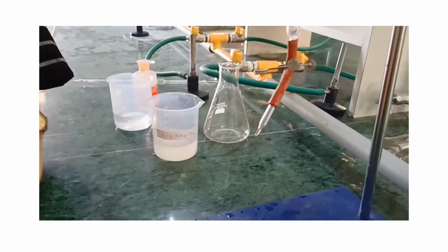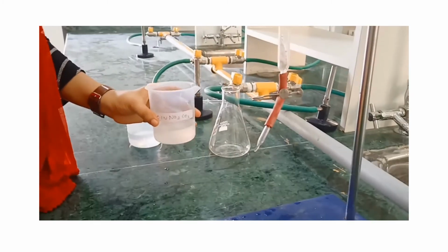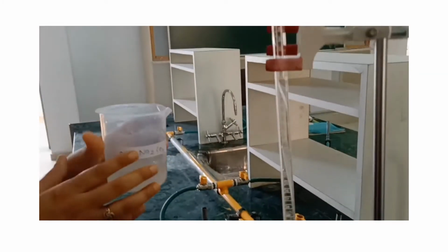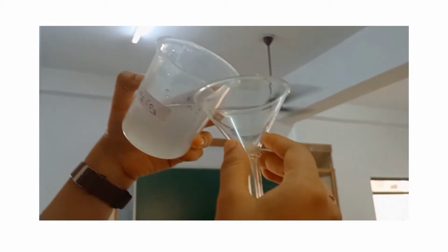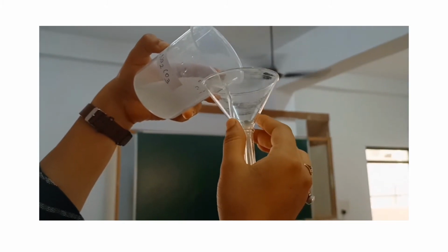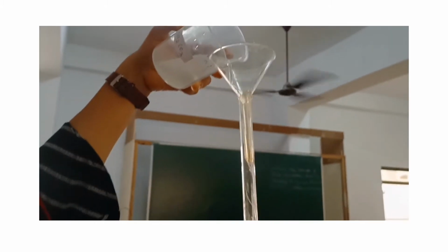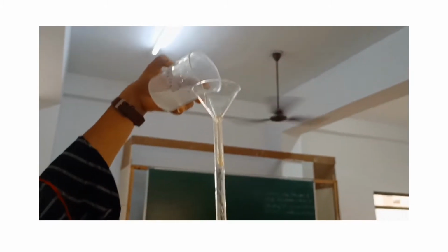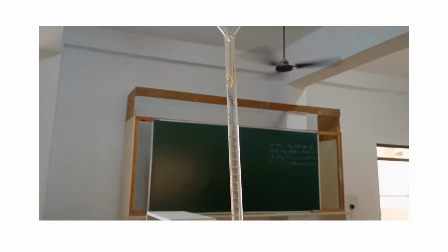So children, after washing the burette, we will fill it with Na2CO3. So let us fill it with Na2CO3. Always remember to place a funnel. Fill the burette with the help of the funnel. So you can see that we are filling the burette with Na2CO3, and now come to the bottom section.